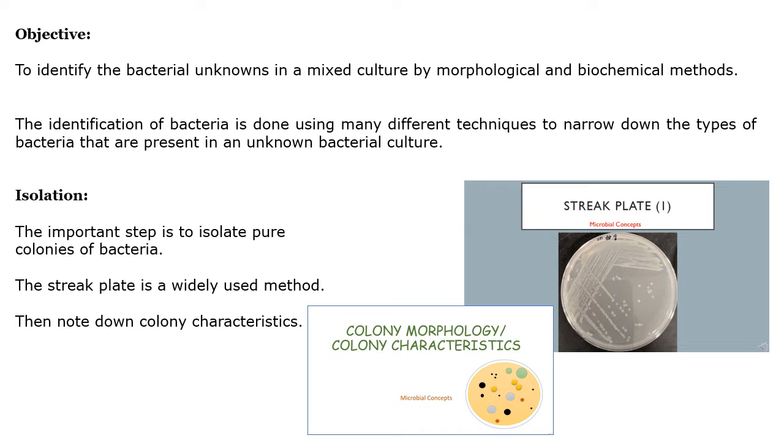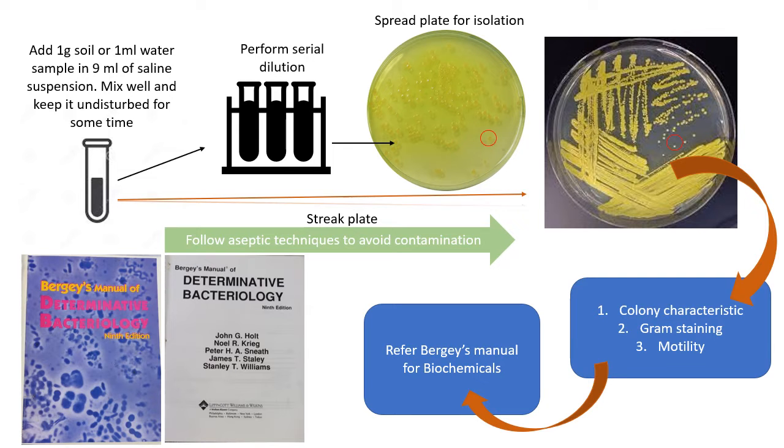Once the isolation is done, we perform colony characteristics and note down our results. Then we perform gram staining and motility, and then we move further to Bergey's manual for identification.